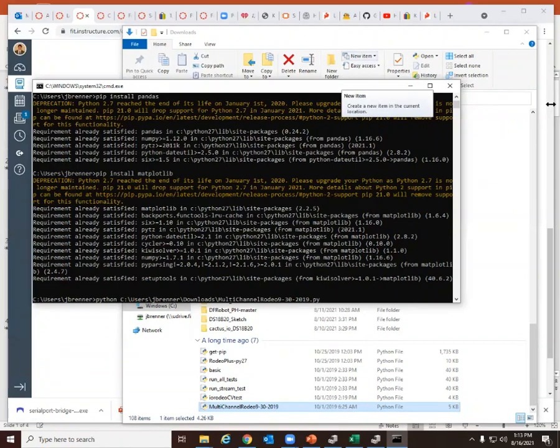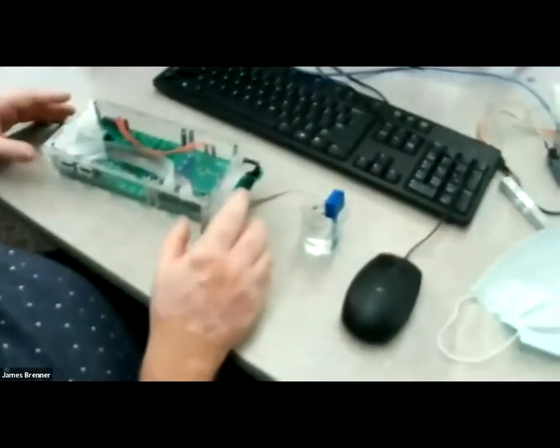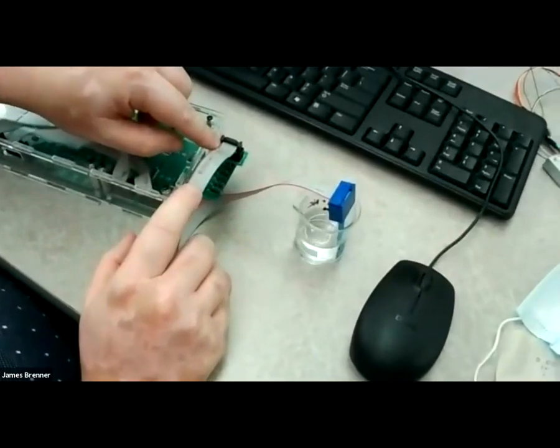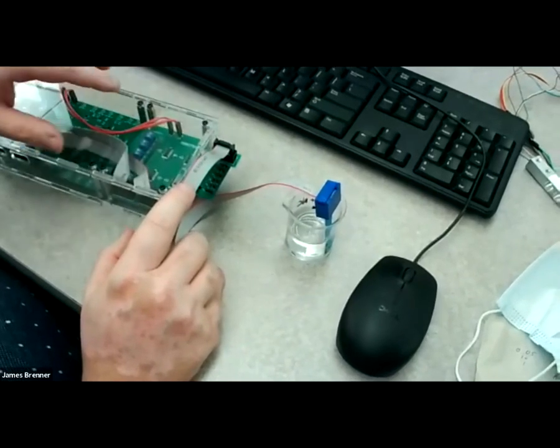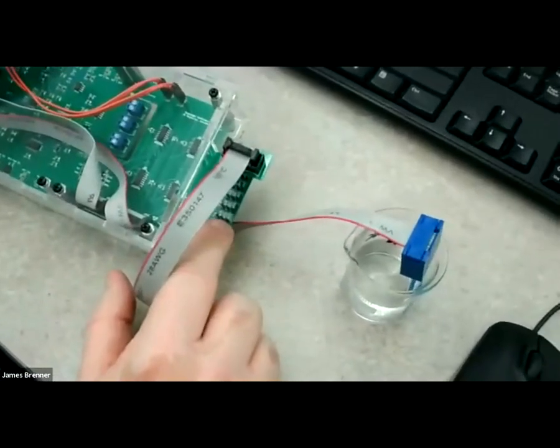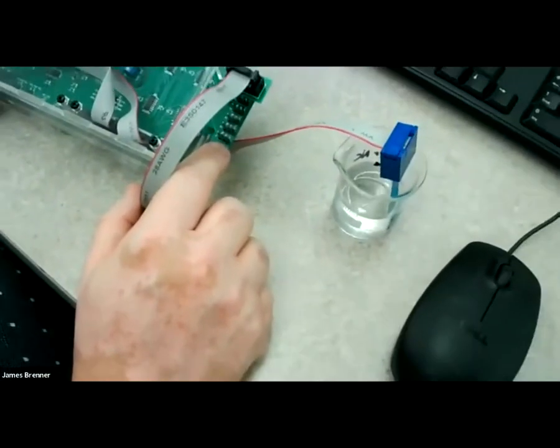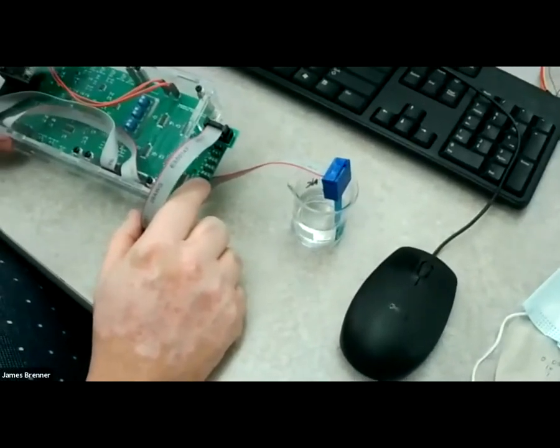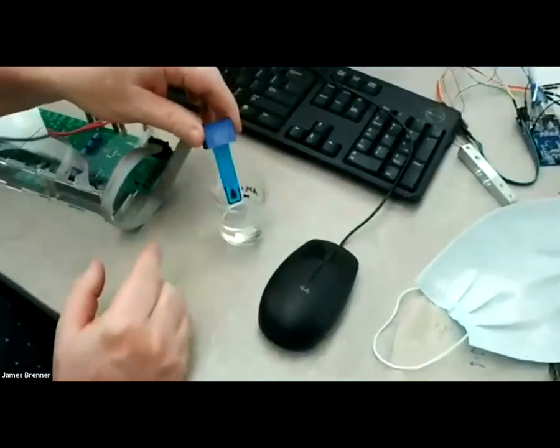Ultimately, I'm going to have to hit return for that, but I want to make sure that the camera records a few things. First of all, you need to have the red wire connected to the left side on here. If you get really close, you probably won't be able to see that there are 3 pins on there. You won't be able to zoom that far in. The 3 pins say CTR for counter, REF for reference, and then WK and then a number for the working electrode.